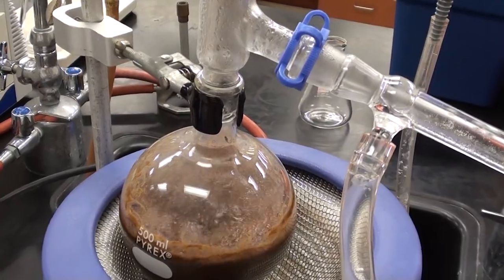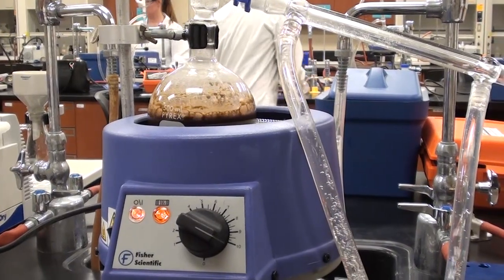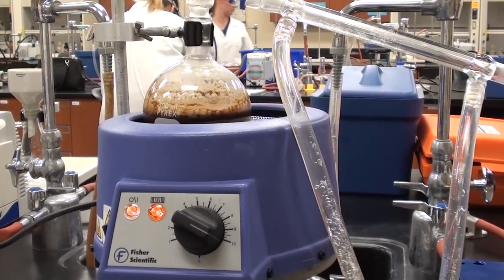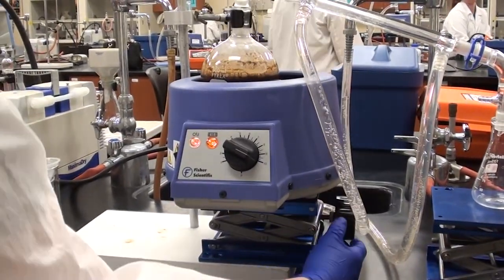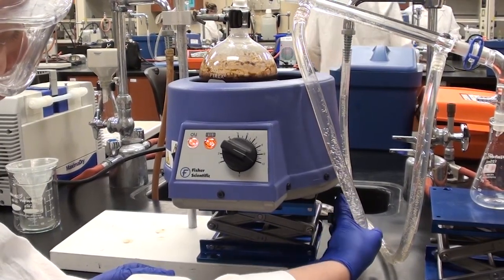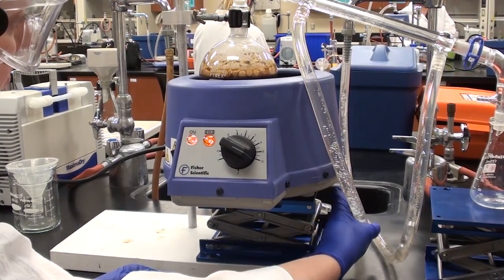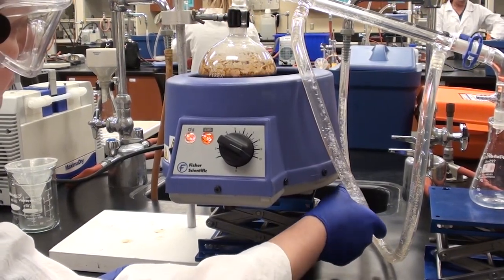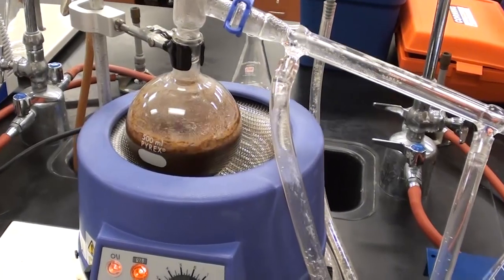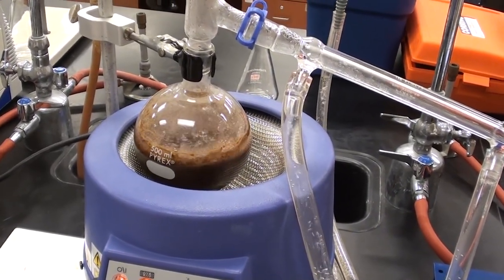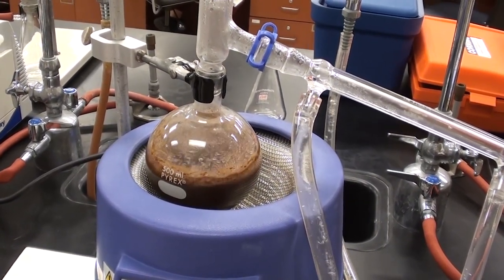If I was to put this directly back in the mantle, the whole thing would foam up and we'd have foam coming over through the condenser, and we don't want that. So we're going to leave it like this for now, and I'm going to ask Cassidy to very slowly raise the mantle. Keep it touching the side, and just raise it up maybe an inch. She's going to wait about five minutes, and then she's going to do it again. As long as it's not foaming, then we're in good shape.